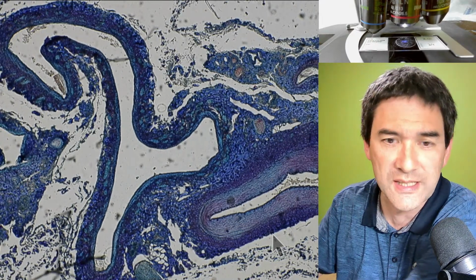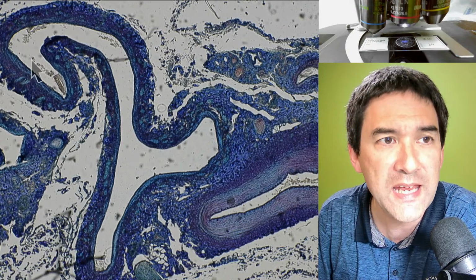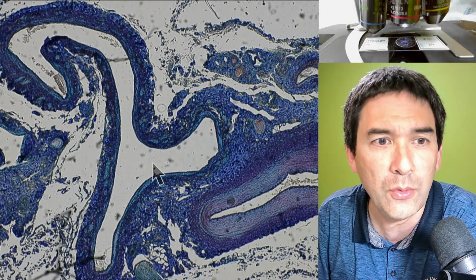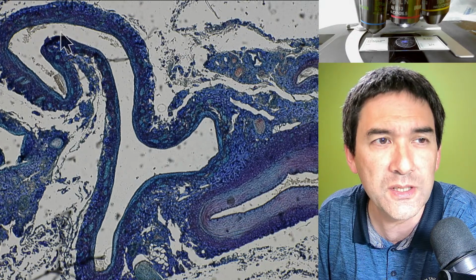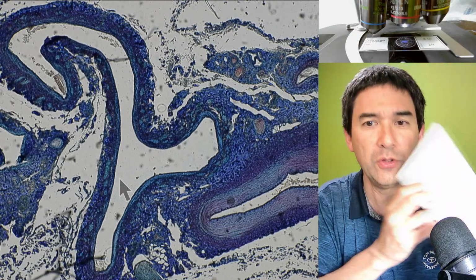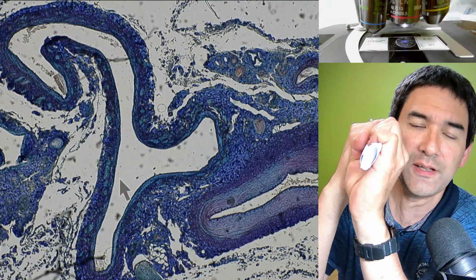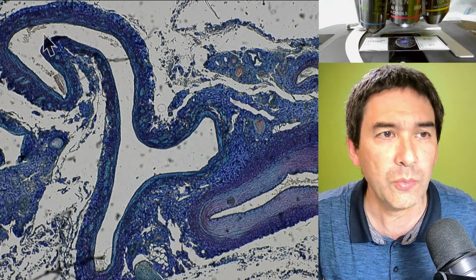I've made separate videos of exactly this same slide. This one over here is the cross-section of a vein. You see it's kind of collapsed. So you see that it's quite flexible here. And right now the inside here is white because there's not a lot of blood. But over here you see again a little bit of some of these blood cells. I'm just going to roll up a piece of paper. If this is the vein, then it's kind of collapsed like this, right? And that's the reason why it looks the way it does over here.